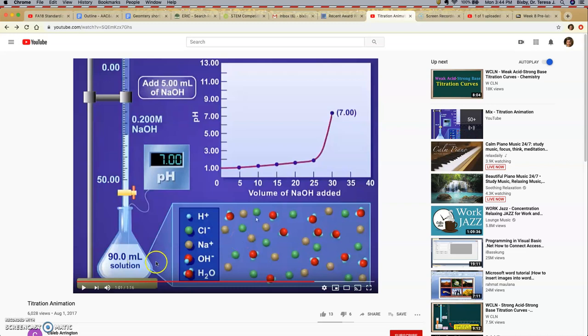In a pH curve titration, we're going to continue this measurement, and we're going to go beyond that equivalency point and add extra NaOH, and now our pH is going to rocket up to very high pHs because we're adding excess NaOH, okay? So we're going to look at this curve in its entirety to try to figure out what is the equivalency volume. Now, one way that you can do that is just to look at the steepest part of this rise and say, okay, right here in the middle of this rise, where I know my equivalency point should be at pH 7, I'm going to go across to my equivalency point, and I'm going to come down and say, oh, that's about 30 milliliters.